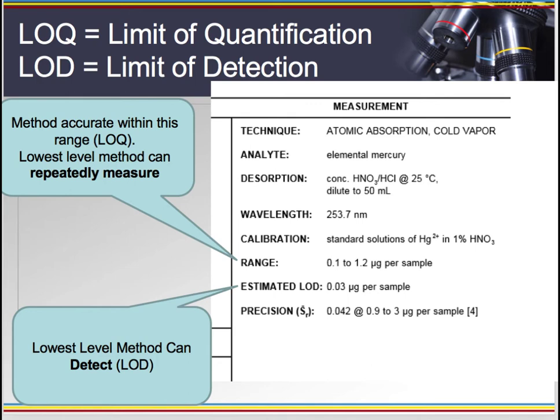And these are important concepts because some folks like to use data that's below the limit of detection or the limit of quantification when they are doing their industrial hygiene calculations, when they're calculating a time-weighted average. And the risk there is quite large, in which you are saying something is there when it is not, or you're saying it's there at a low level, when in truth it simply cannot be accurately measured, limit of quantification, or accurately detected, limit of detection.